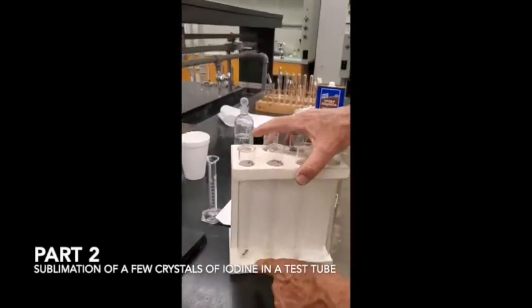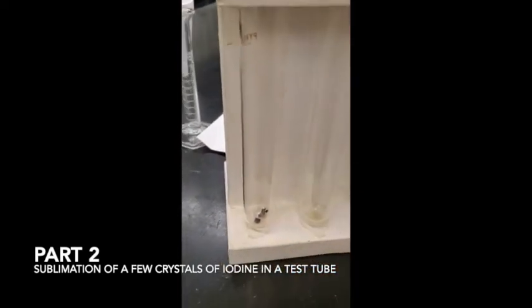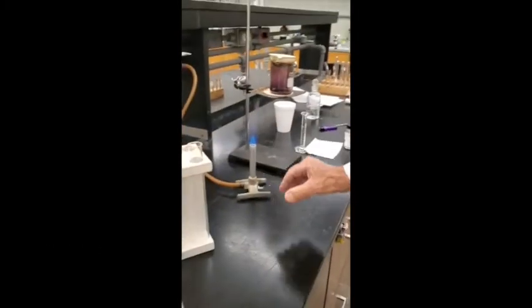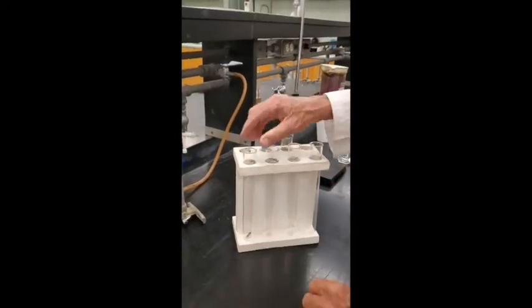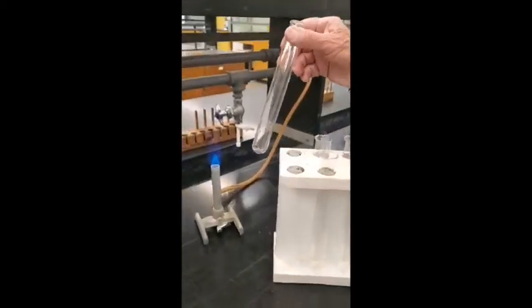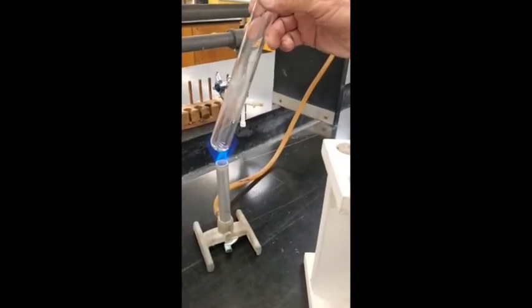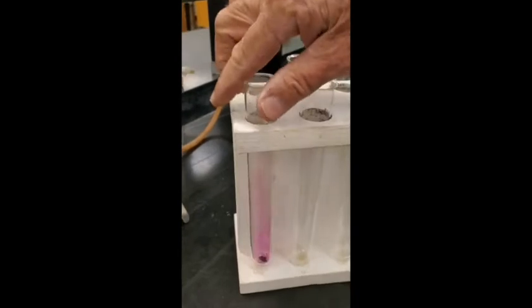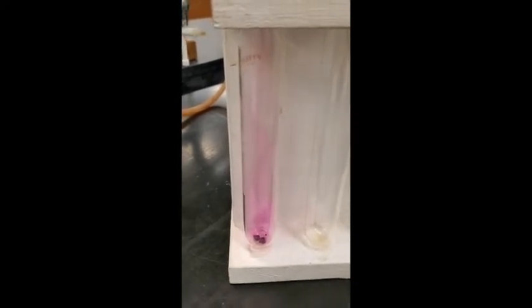Okay, I put 2 or 3 crystals of iodine into this test tube, and I'm going to heat it, and we'll see if there's any evidence of vapor being produced. Through sublimation, it does sublime. See any evidence of vapor in there? Isn't that something? It's beautiful vapor. That's the world's most beautiful gas.